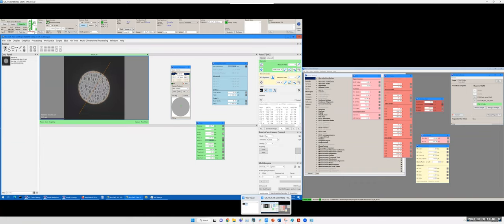So normally we want to correct the lower order because lower orders are more important. So we correct lower order. You can see the beam is changed by a lot and then measure again. So we want to make sure lower order values are close to 100%, and then we click the third order. Okay, we see a lot of 100%, so we can start to correct.